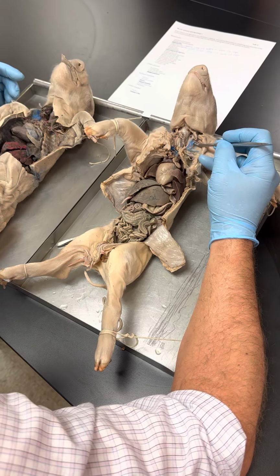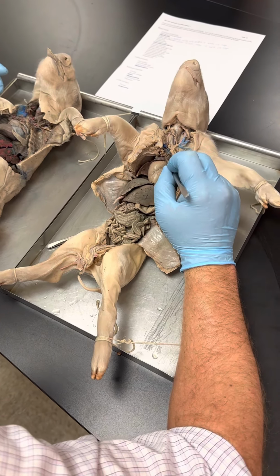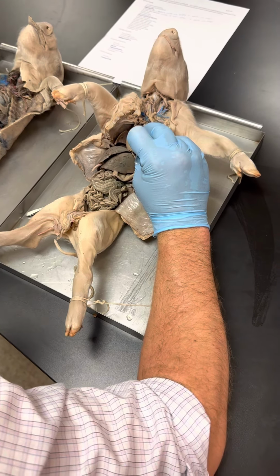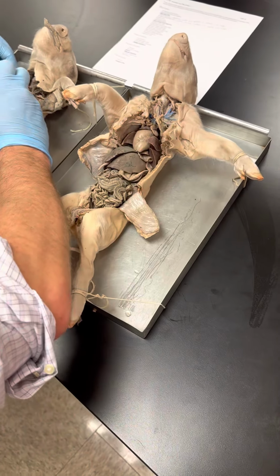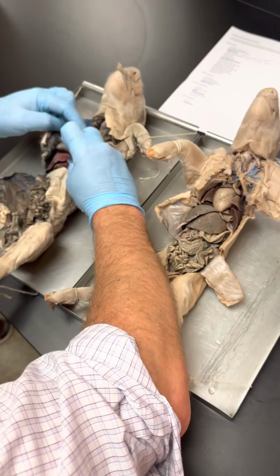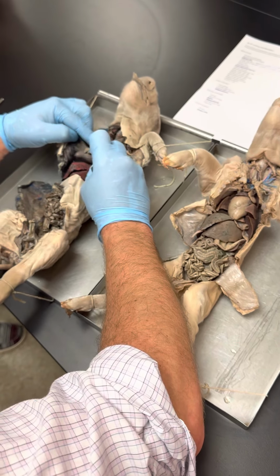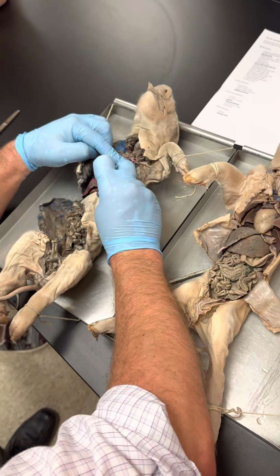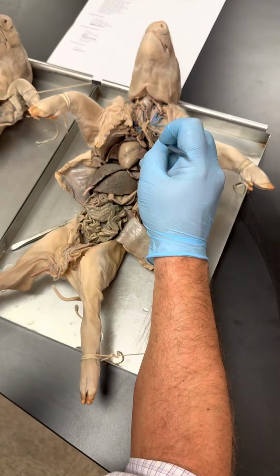Now we'll go subclavian vessels. So here's our ribs. If you go just inside those ribs, I'm going to pretend that's a subclavian right there, because sometimes you got to pretend in A&P. Subclavian. It's way under there. So if it's inside this rib cage, we know it's subclavian. Once it pokes out, it becomes your axillary. Axillary. And here's axillary.